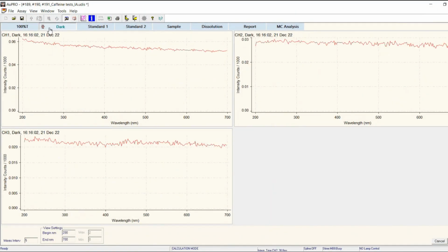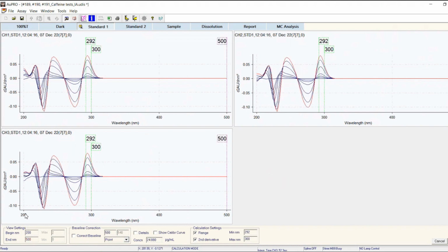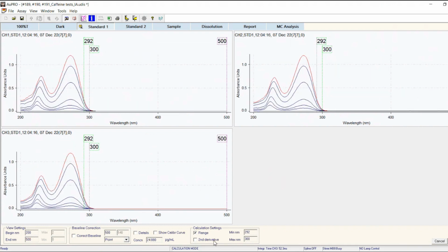And so with SCISSOR, we normally work in the second derivative spectrum. This allows us to remove any problems with the baseline, any scattering that we may see during the assay with bubbles and things like that, so that we can work with the data.